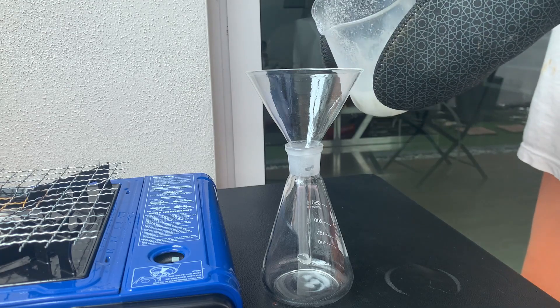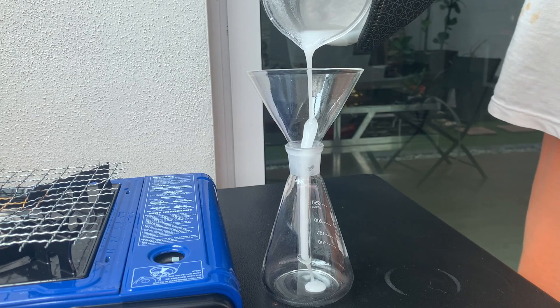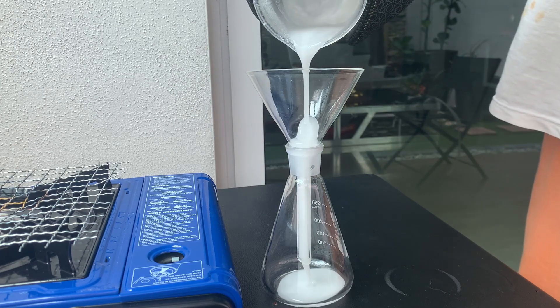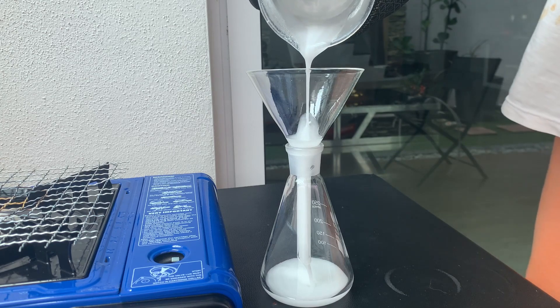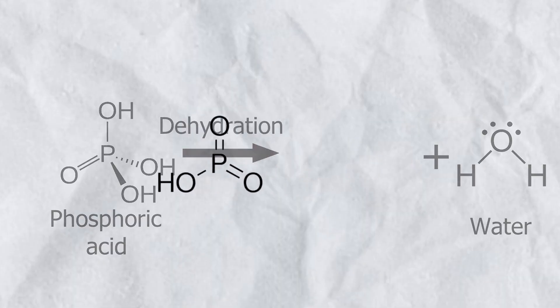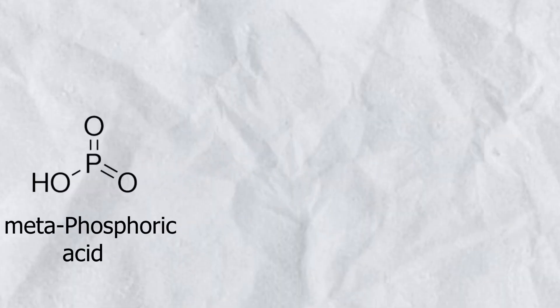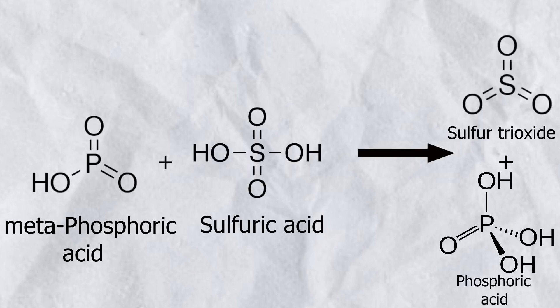While it is still hot, I poured the metaphosphoric acid into a 250 mL Erlenmeyer flask. Now that we have our metaphosphoric acid, we can go on to the next step. With our newly obtained metaphosphoric acid, we use it to dehydrate sulfuric acid and turn it into sulfur trioxide.